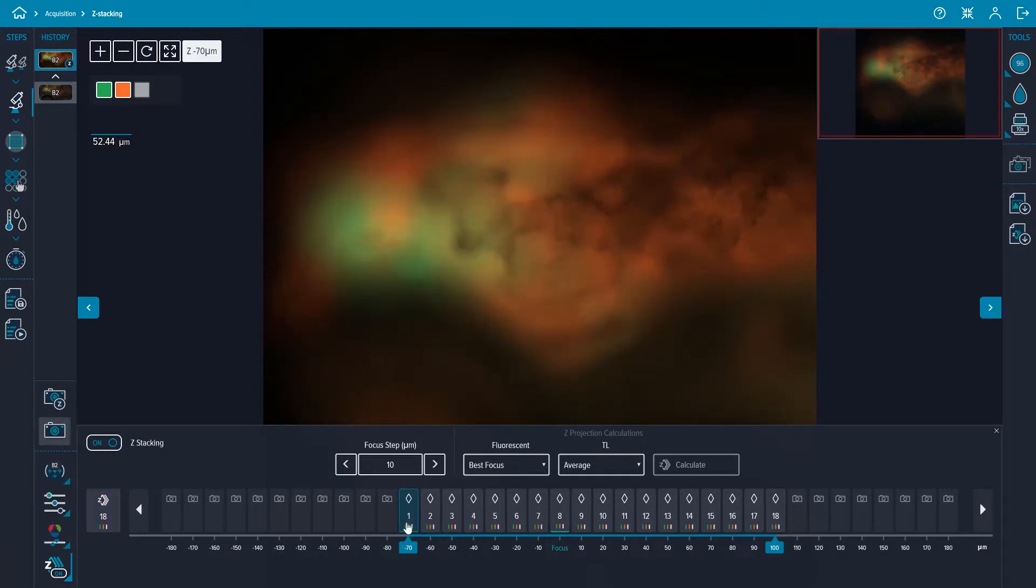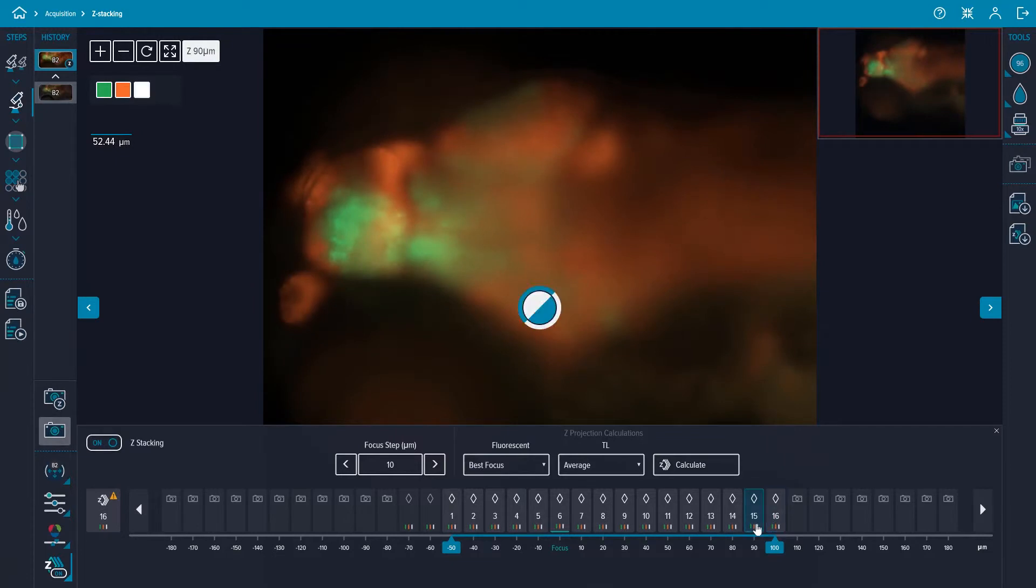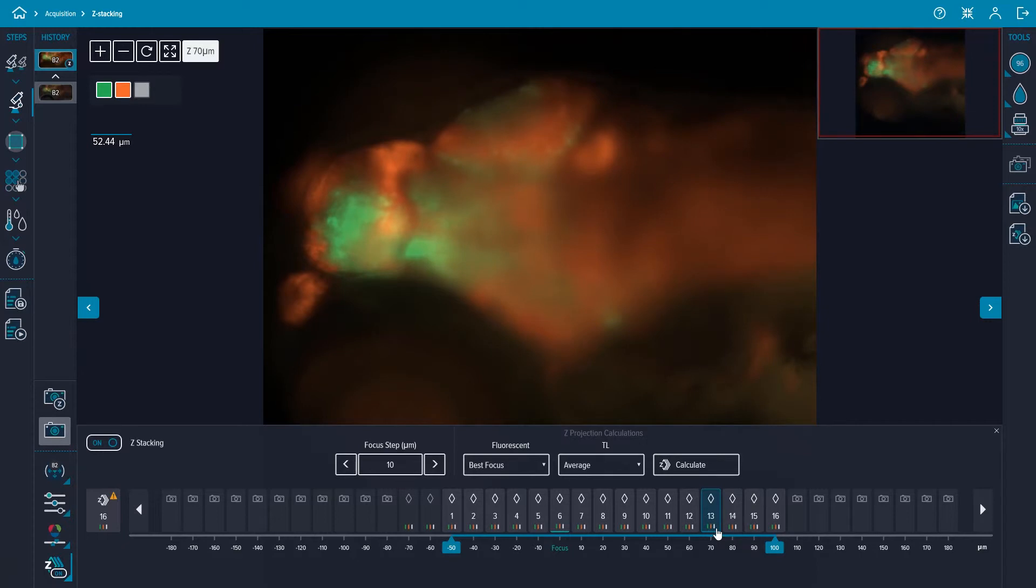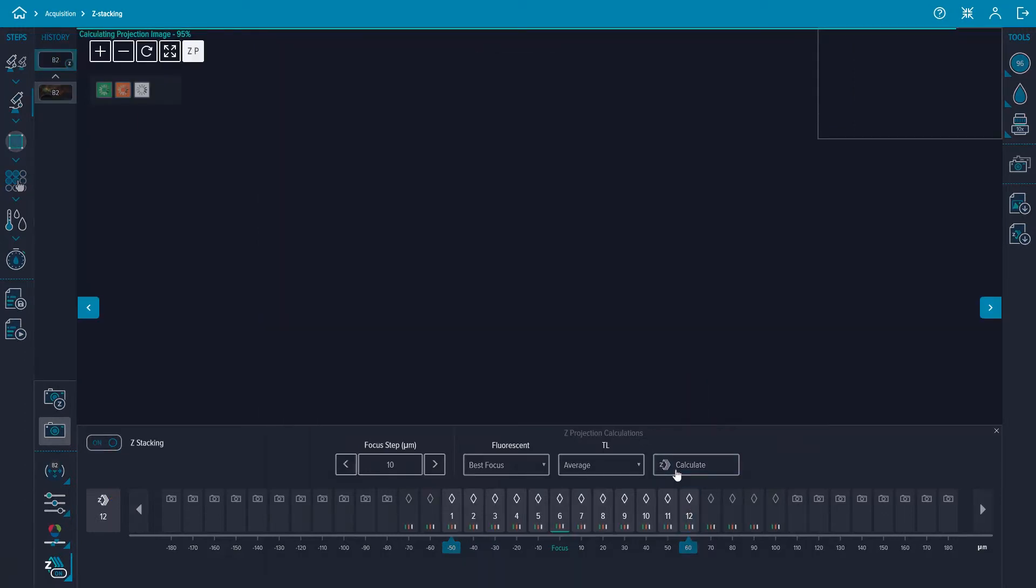Toggle through the z-planes captured in the z-stack and move the sliders to optimize the number of z-planes you want to include in the z-stack. If you expand the number of z-planes, then you have to recapture the z-stack. If you decrease the number of z-planes, you can select the calculate button to automatically generate the new z-stack projection image.